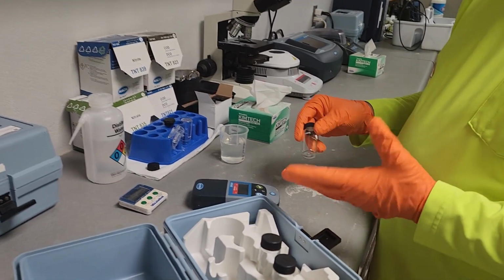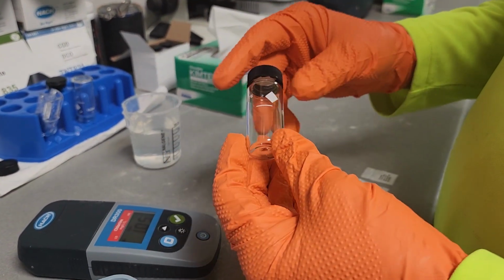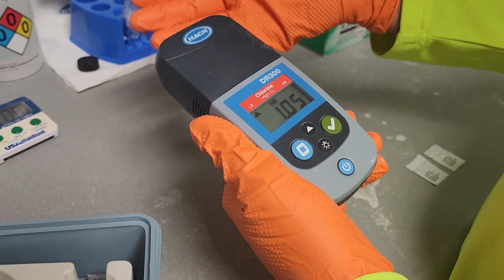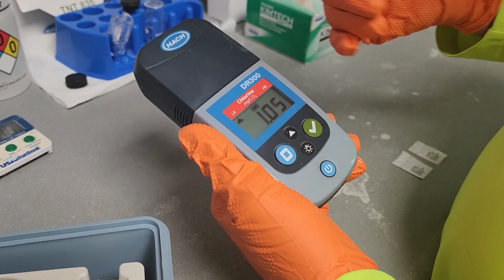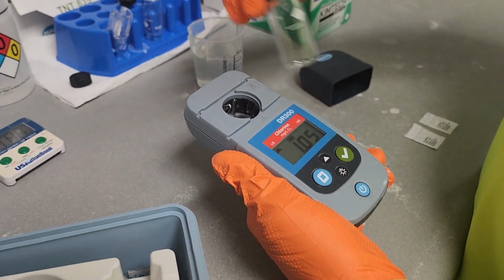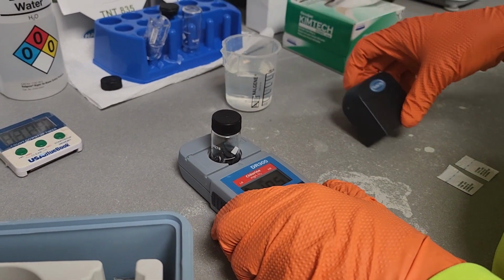Okay, so we have a sample of water. This is a sample cell. You see it's clean. It's got the diamond right here. This is the chlorometer or color meter for chlorine. Low range, high range. We're going to do low range. What happens is inside of here, you want to keep it clean of dust and things like that. But you see where this arrow is, that's where the diamond lines up. Goes in just like that.